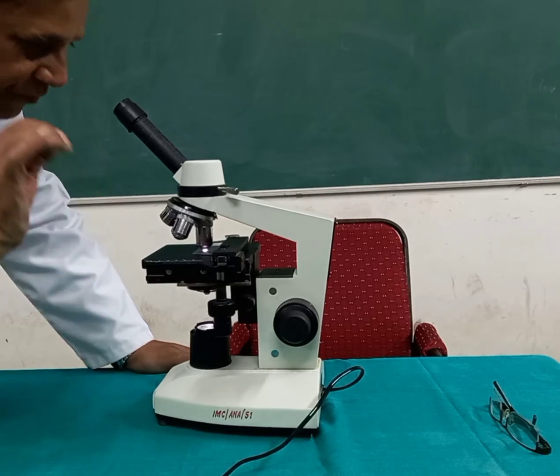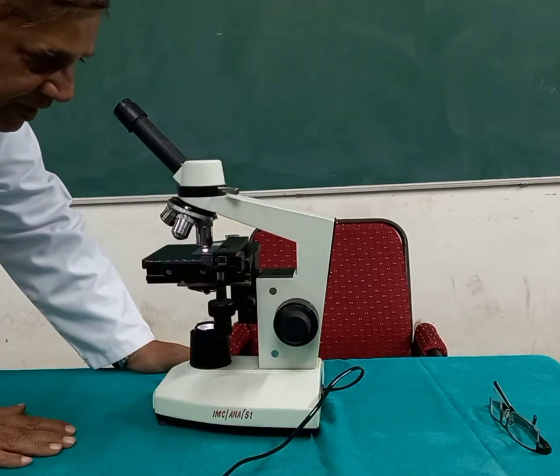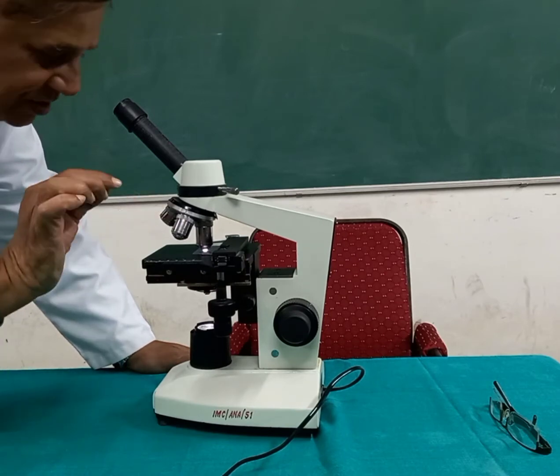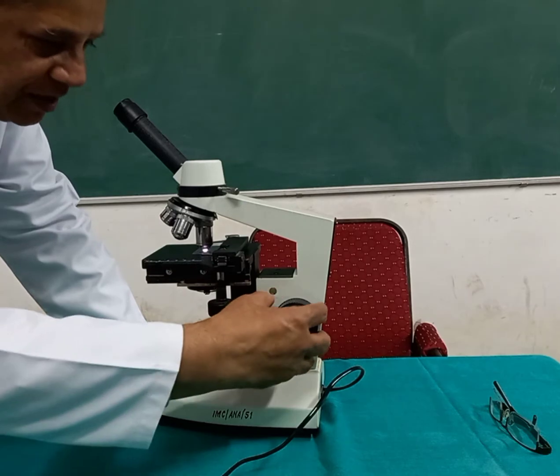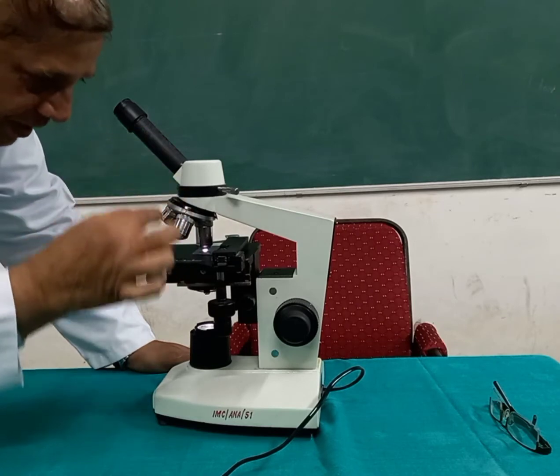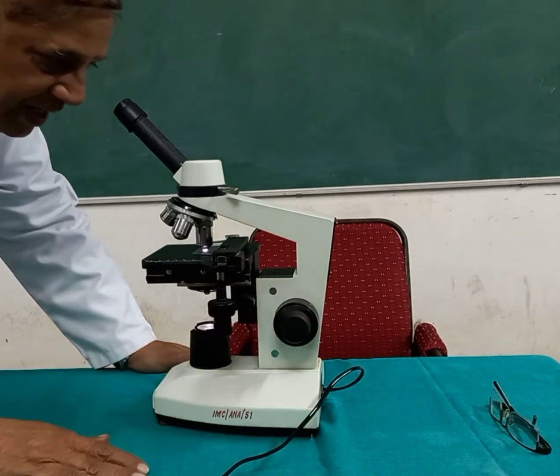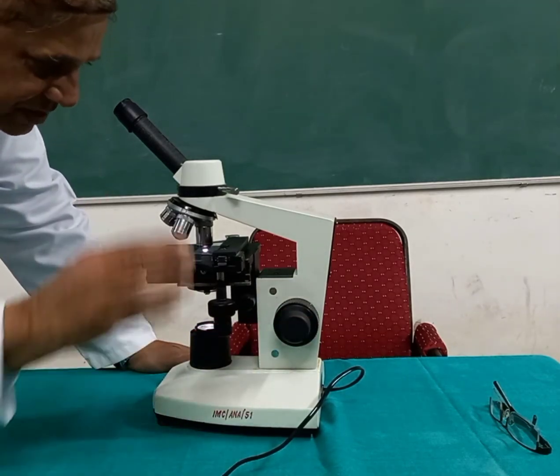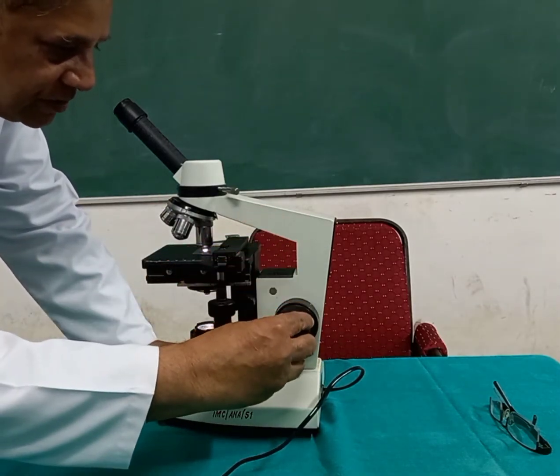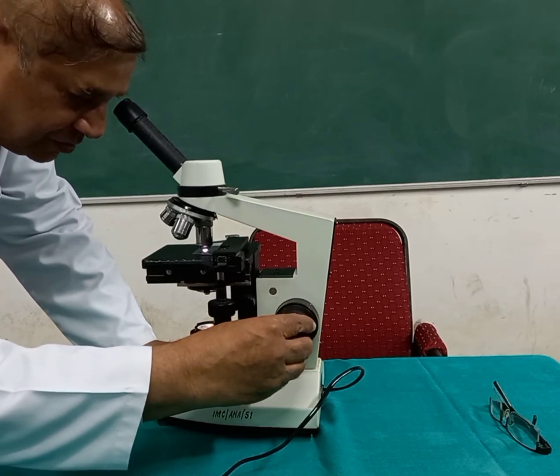Now the very important step is that now don't touch this coarse adjustment. Why should you not touch the coarse adjustment once your objective lens is in 40x? The reason is that if you move the coarse adjustment, the stage will go up and down, and since the slide is very close to the objective lens, the slide will break. After bringing the lens to 40x, you should only touch this fine adjustment and move the fine adjustment in either direction till you get the best image.